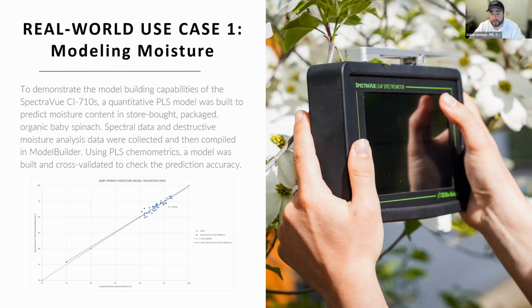This is a great tool that you could use to model those shelf lives and inform you in a non-destructive way. So you wouldn't actually have to lose product after building the model. Non-destructive way to tell you that this product is going to last for another couple of weeks, or this product is going to go bad tomorrow. So that's a really interesting use case, I thought, for this device that might be a little bit unconventional when thinking about spectroscopy in the ag sector.